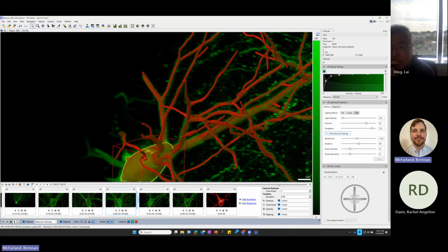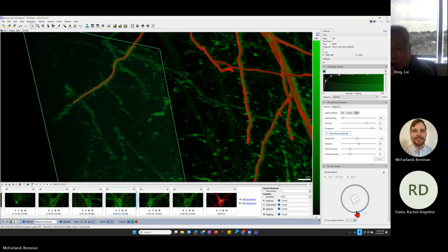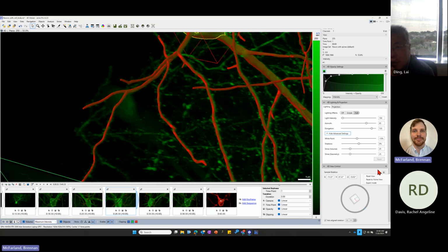So it's keeping it as a center point here, but it's keeping it center to our viewer rather than center to the object itself. So I will look and see if we can rotate around an object's boundaries.